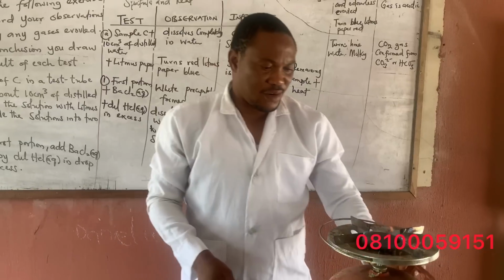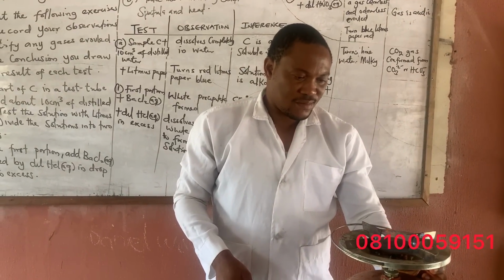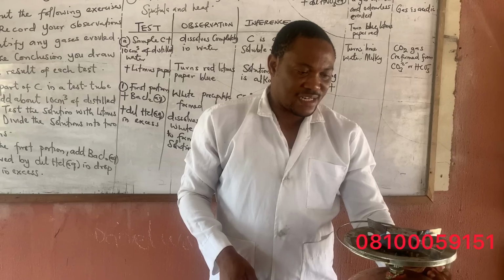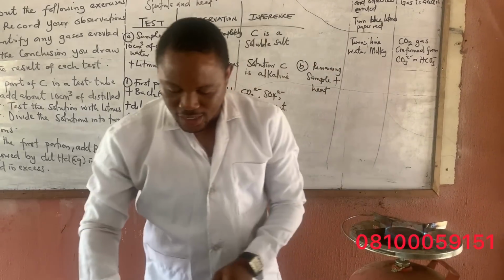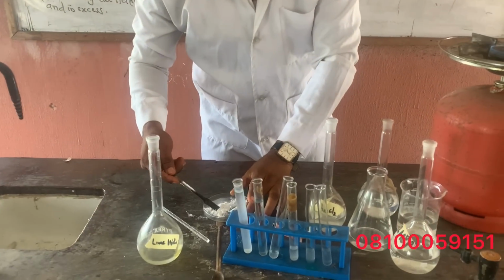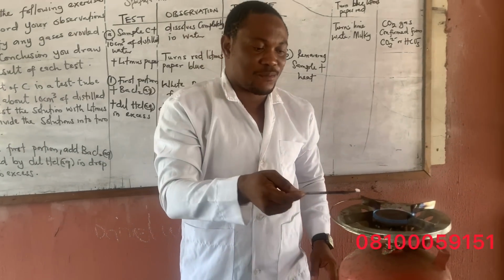Okay, let me lower it, because I need that blue flame. Okay, good. Now look at this. Take part of the salt. Can you see? This is the salt now. Look at it.